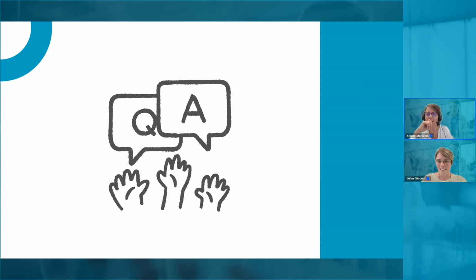Another question about STR from Lina. Can you speak of the advantage of your STR assay compared to general STR assays? I think our STR assay is the same as other STR assays in technical aspects, but the biggest advantage is that you can perform several tests by sending just one sample.